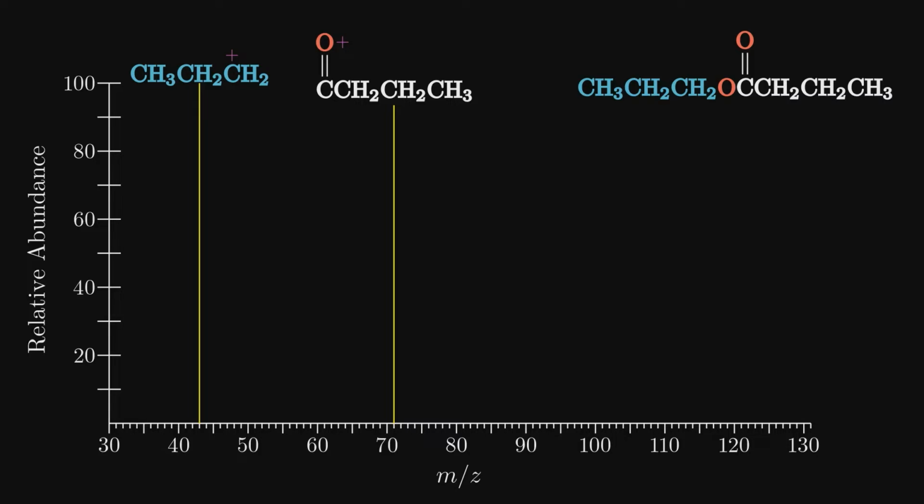I left out other peaks from the real spectrum, but both of these are as prominent as depicted here. The database, which you can find in the script, showed no molecular ion at 130, and the peak data had no value either. For the other esters, the molecular ion was either very tiny or non-existent.